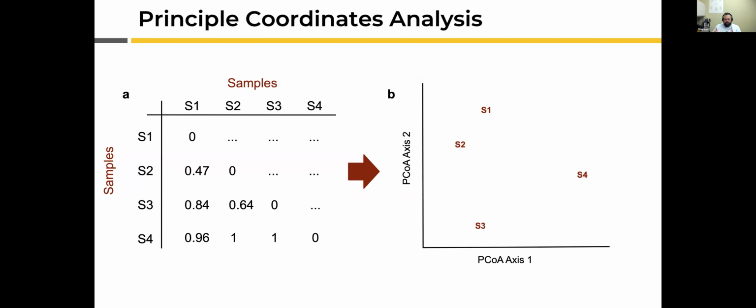In principal coordinates analysis, and the next one we'll see, the important part, when you're scaling down from many hundreds of dimensions to 2 or 3, is maintaining the distances between objects as you're shrinking dimensions. And that's one of the things that PCoA can do as well.